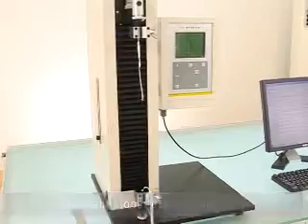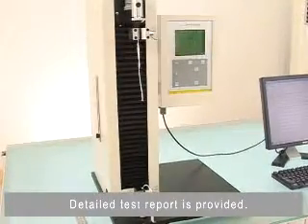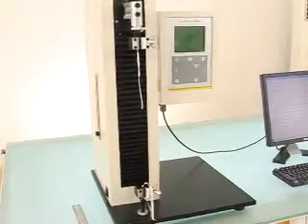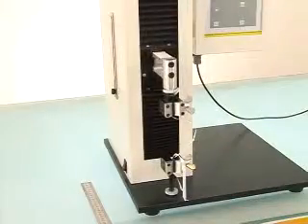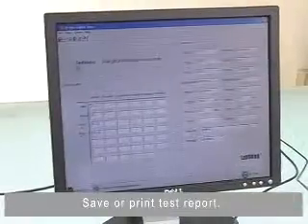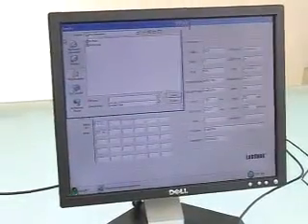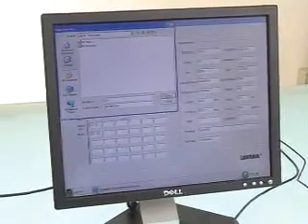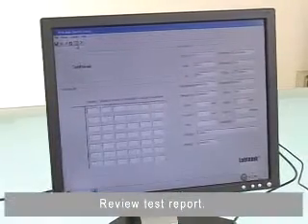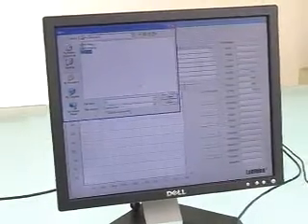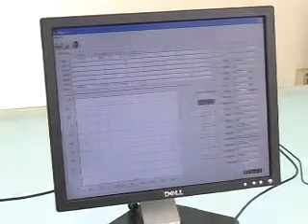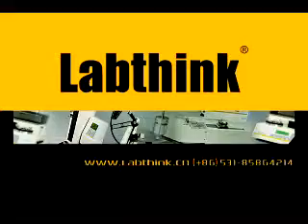The instrument stops the test automatically and the clamp jaw returns. A detailed test report is provided. Save or print the test report, and review the test report as needed.